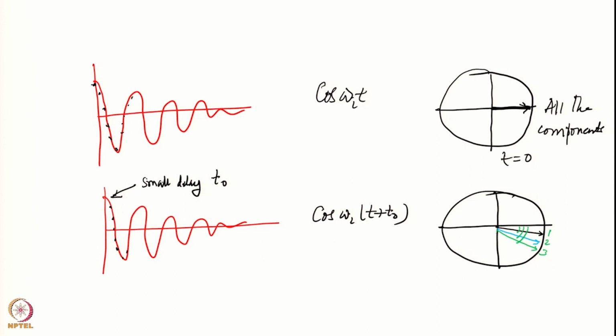Compared to the previous one, which was a zero order phase, in this case, because of the delay in the data acquisition, the different frequency components in your magnetization have moved to different extents. Therefore the first line would have a mixture something like this, let me call this 1, and the second one may have some more here, and the third one would have even more, and so on.